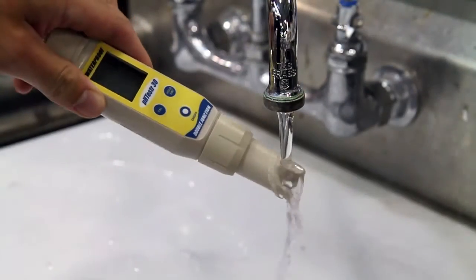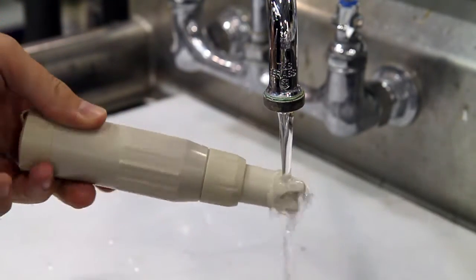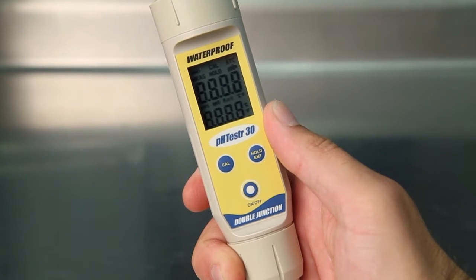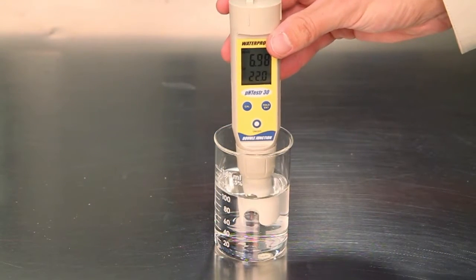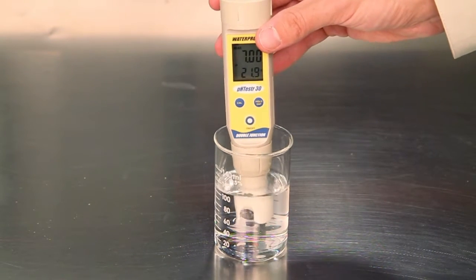Rinse the electrode with tap water before measuring the pH of your sample. Measuring pH. Press the on-off button to turn on the meter. Place the electrode approximately 2 to 3 centimeters below the water surface. Stir gently for reading stabilization.